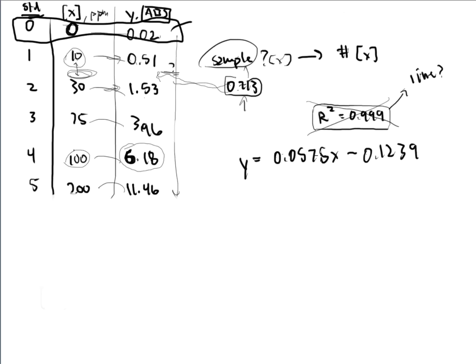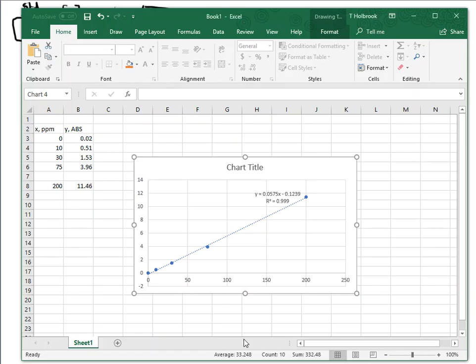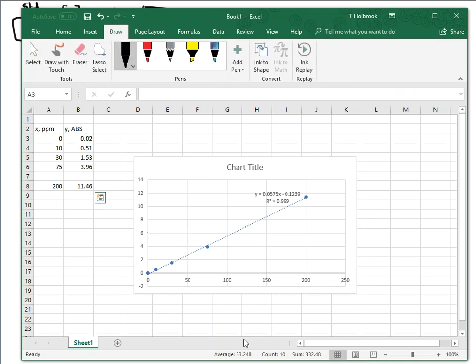So the rules of algebra state that if I go to this graph and I try to find any type of absorbance, absorbance was on the y-axis, right? If I have an absorbance of 6, right there it is, I can go over until it meets the line and then come down to figure out where on earth I would be as far as the concentration.